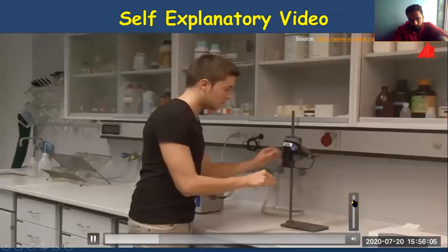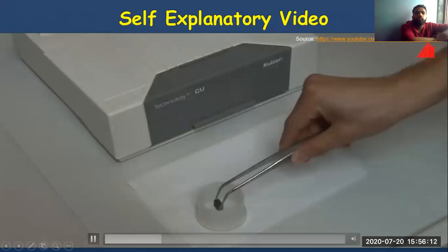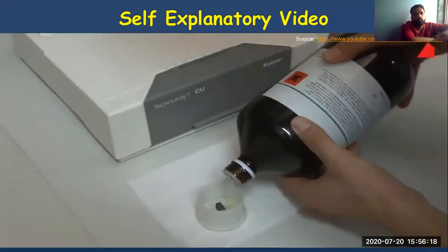To mount the specimen, small plastic molds are suitable. The material tester picks up the clean specimen and carefully places it into one of the molds. The intended plane of examination is at the bottom. Then he pours liquid resin into the mold.